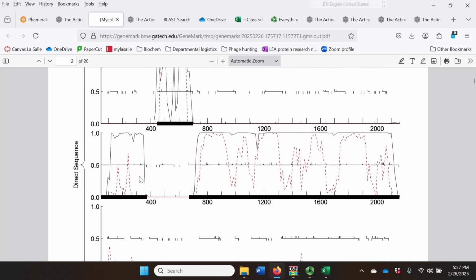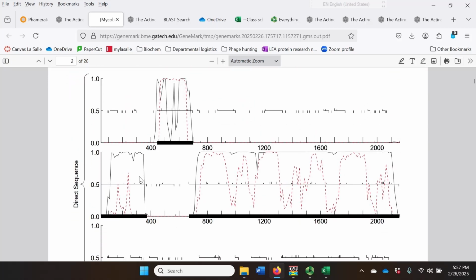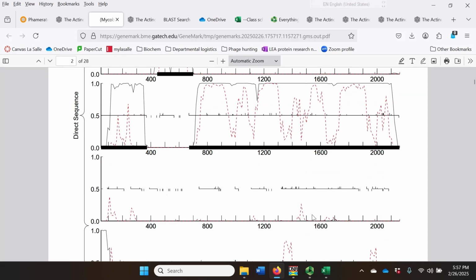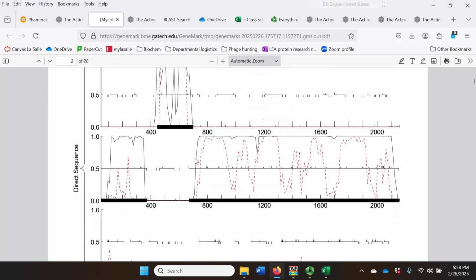And it's looking for sequences that stand out as matching a real gene, as opposed to the kind of sequences that you would have in a sequence that's not encoding a real gene, or in a different frame that's not encoding a real gene.